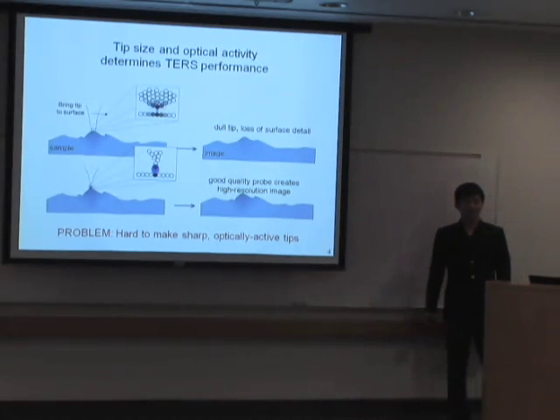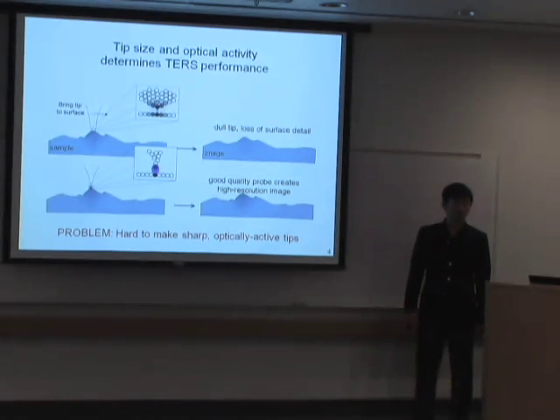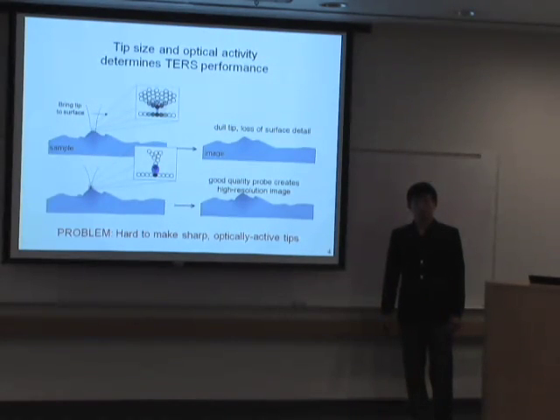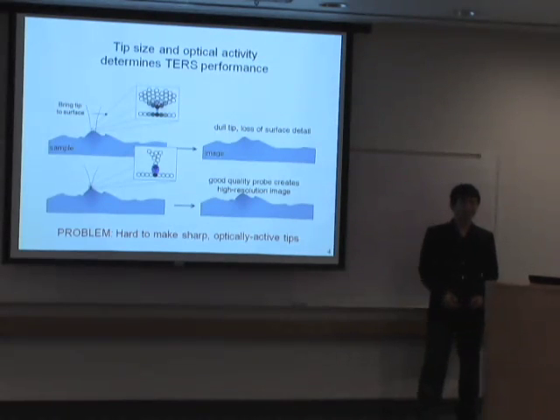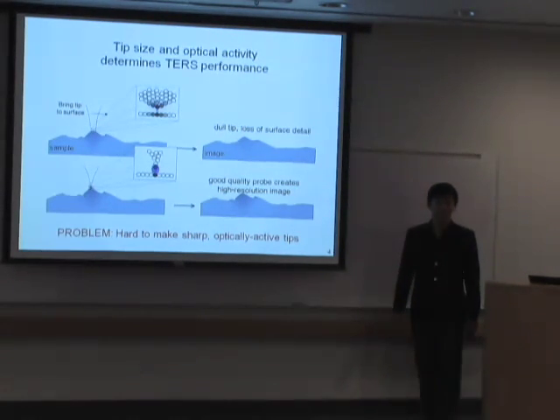I saw that you're going through different frequencies and testing the tuning fork. Do you know what kind of effect it would have if you changed the frequencies from maybe thousands of hertz, maybe tens of hertz, or maybe up to megahertz? If it makes a difference. So the tuning fork oscillates at a very specific frequency, depending on the environment it's in.